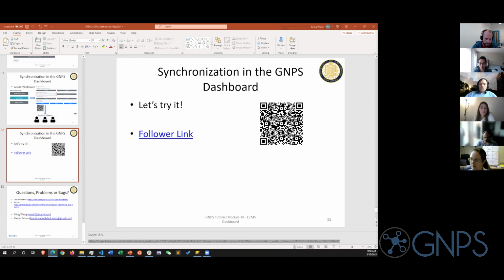Okay, was everybody who wanted to able to click on the follower link? Yes. Awesome. Okay, so this is the highest load. We're using like 20 cores on the server right now. I would ask the opposite question: is there anybody who wanted to follow that could not follow? All right, that's perfect. Also, if you just clicked on the first link I posted, Zoom actually cut some of the strings, so I just posted a tiny URL that should work. Awesome. Thanks, Daniel. So let's reload it.